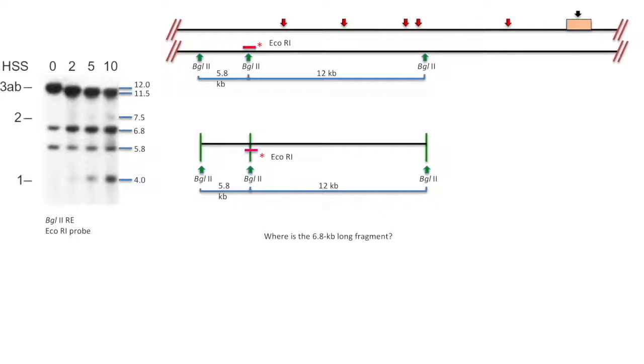Then where is the 6.8 kb long fragment? There must be one more fragment of Bagel 2 that is complementary to the probe somehow else in the chromosome. And because this band is not in the globin gene control region, we can ignore it.